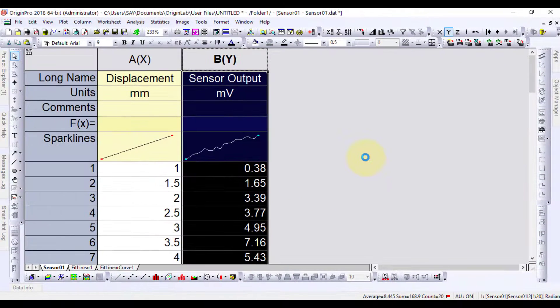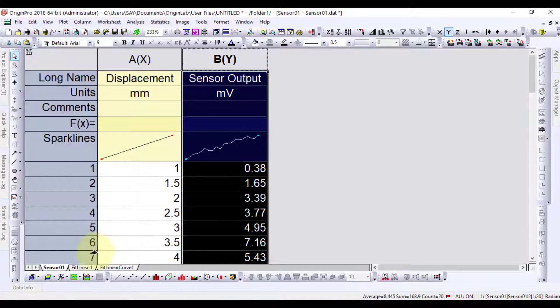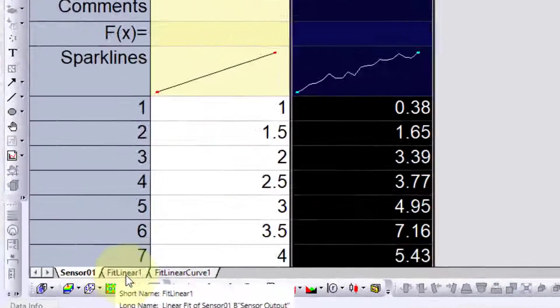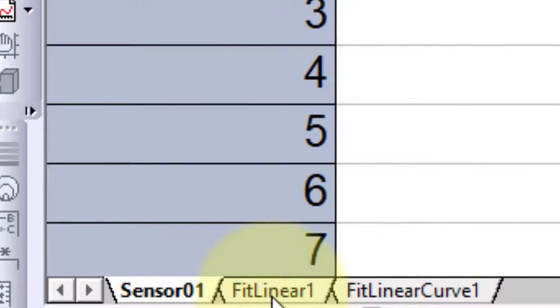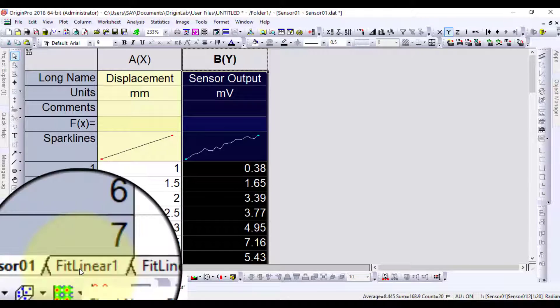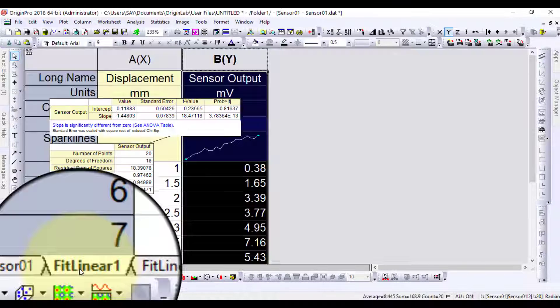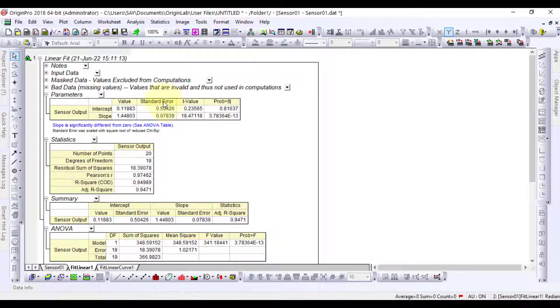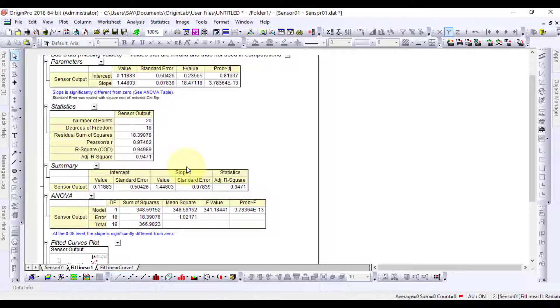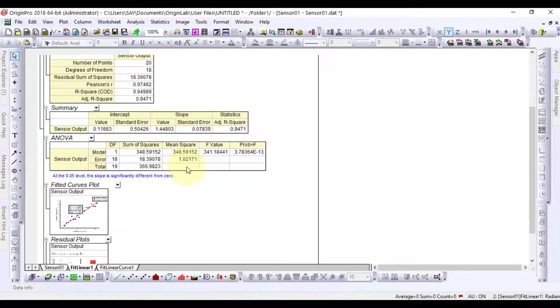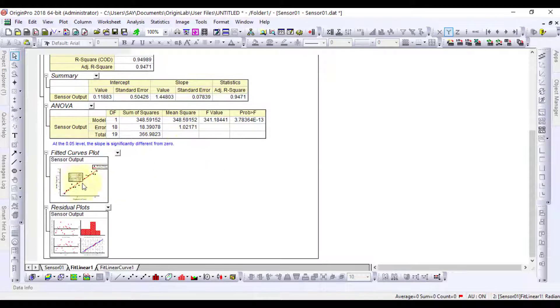It has generated two data sheets. Go to Fit Linear 1 data sheet. It has generated all the fitting data and here are the fitting plots.